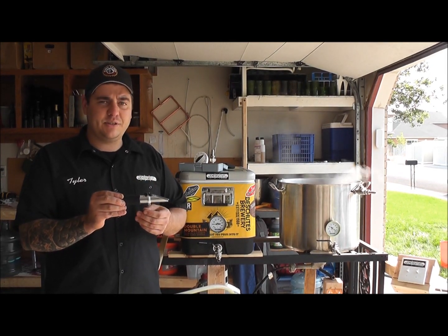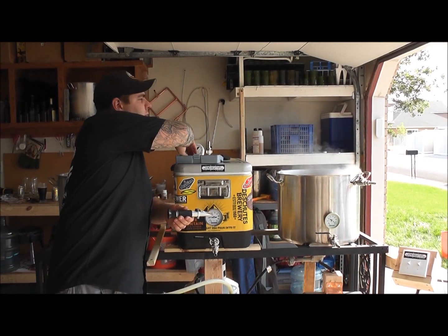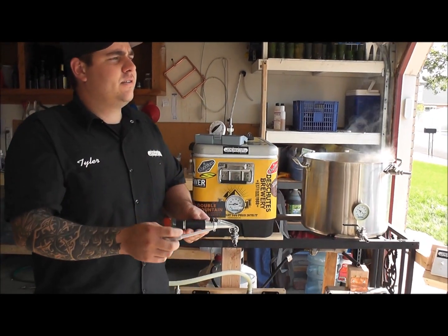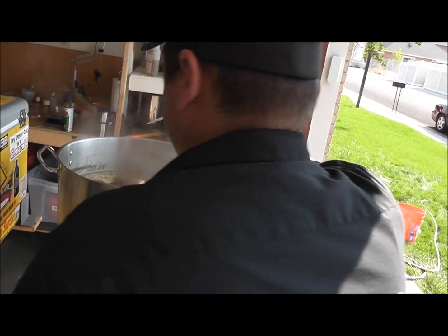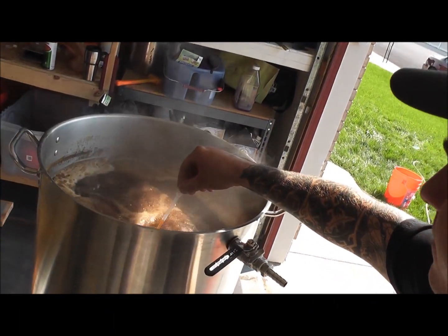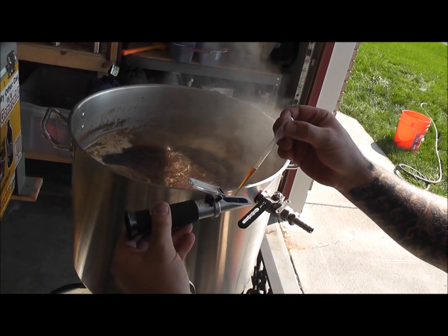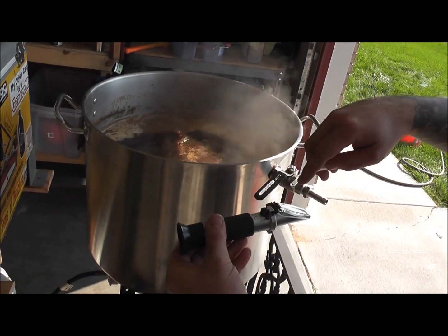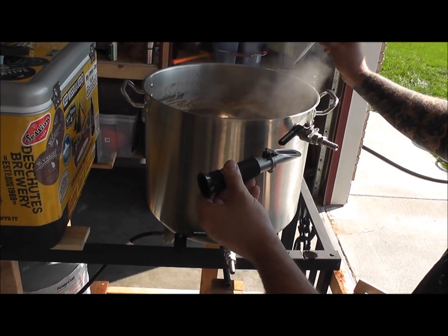I have already done the process, so today I'm going to go ahead and check my original gravity of my beer. Place three drops directly on the lens. Close it. You can look through to see what your original gravity and your percentage of Brix are.